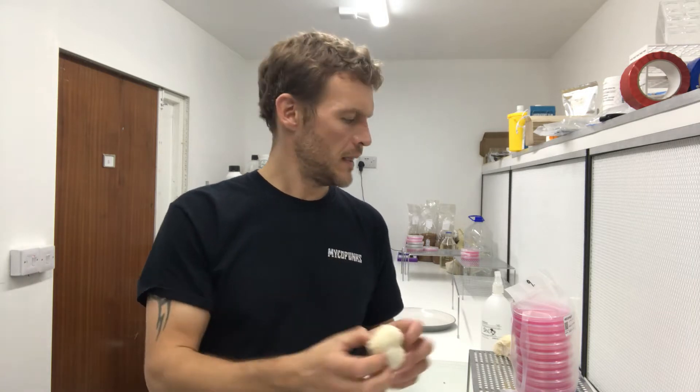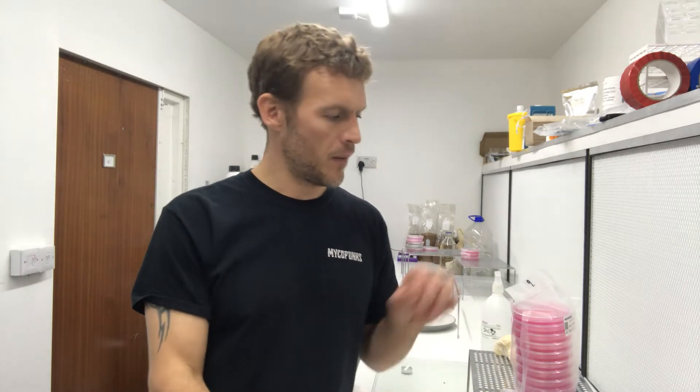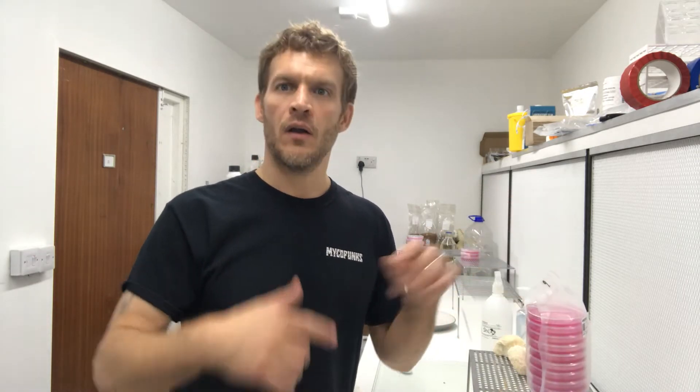So it's good every now and again to actually start again from fresh — get a piece of the fruiting body. In this case I'm using lion's mane, and I'm going to take a small piece of that and transfer it onto a brand new agar plate, then start the whole process again. So let's give this a go, shall we?